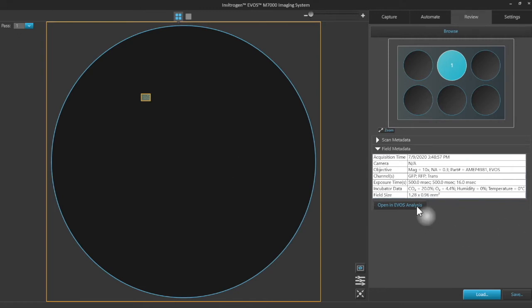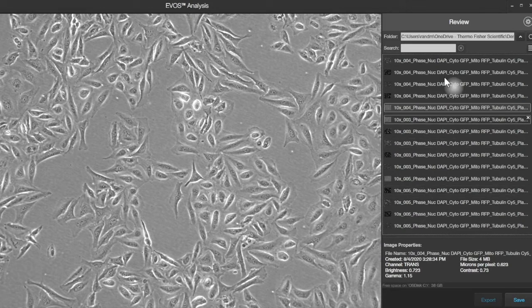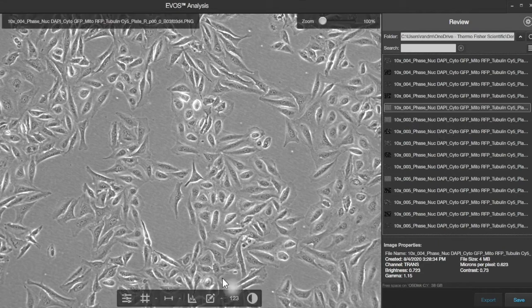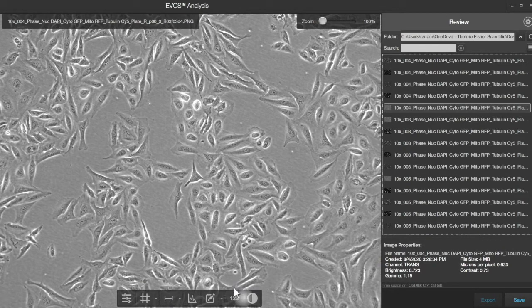We're going to open them in EVOS analysis, so we'll go ahead and do that. Here are the image files for the data set, and this is the transmitted light image taken in phase. With the toolbar at the bottom we have a number of different options for annotation and measurements.